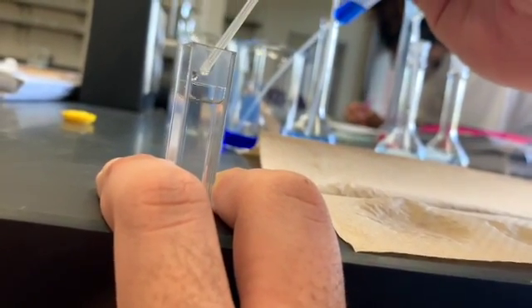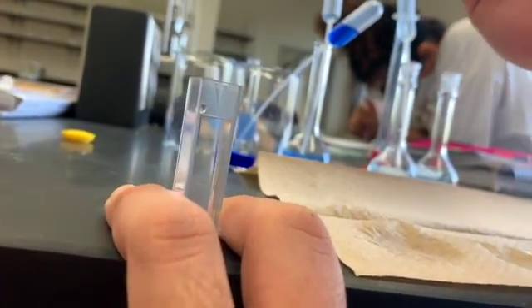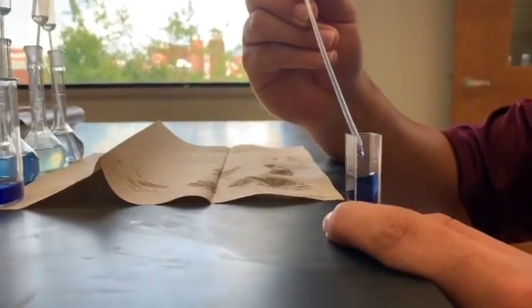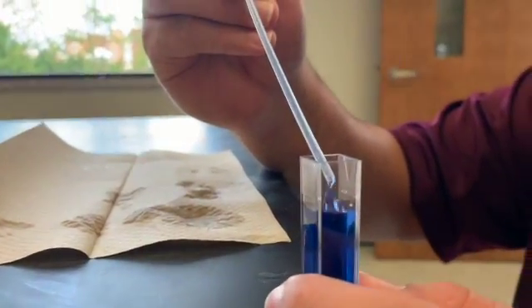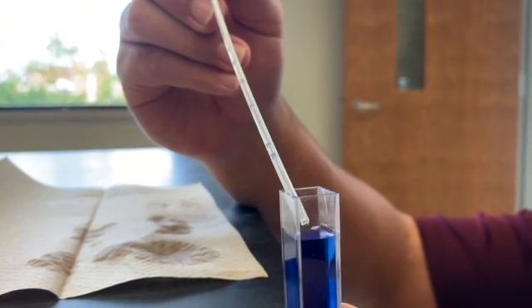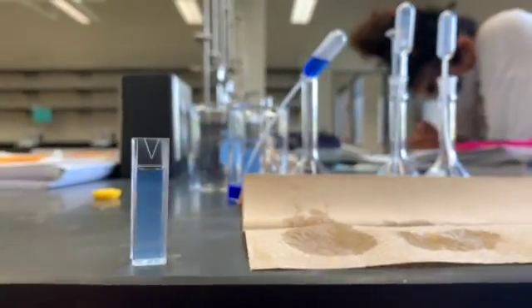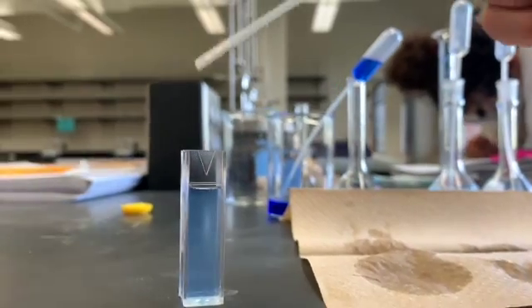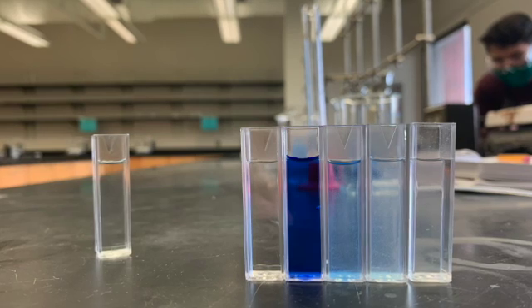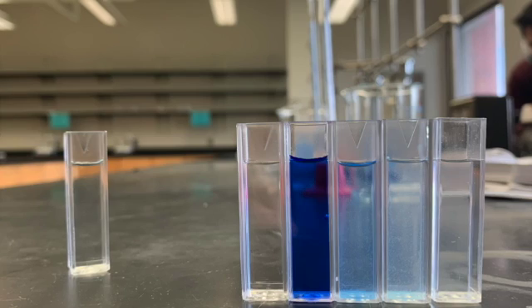Using a transfer pipette, we fill a clean, dry cuvette with a few drops of ammonia and deionized water to make a blank. Next, we fill a cuvette with our stock solution. One more drop. We fill a cuvette with our dilutions from exercise 1 and repeat with all 3 of our dilutions. When filling cuvettes, we add solution until the bottom of the meniscus is touching the line on the cuvette.